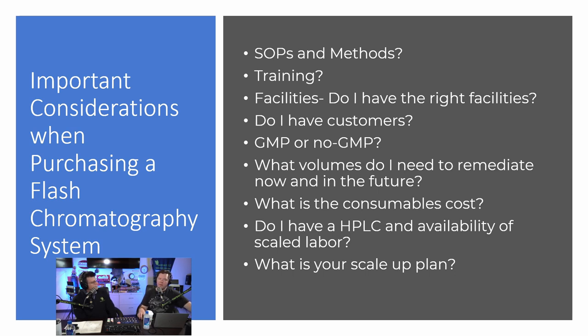If you are talking about, I want to separate out CBC, CBG, and CBD all into different buckets, that would be possible, but you'll go a lot slower. That's the thing, because you're trying to do more with one thing. So you need to define how much CBC do I want to produce every day? And then we would have to work with you, okay, here's the column that you need for that, the size of the column, here's how much you need.